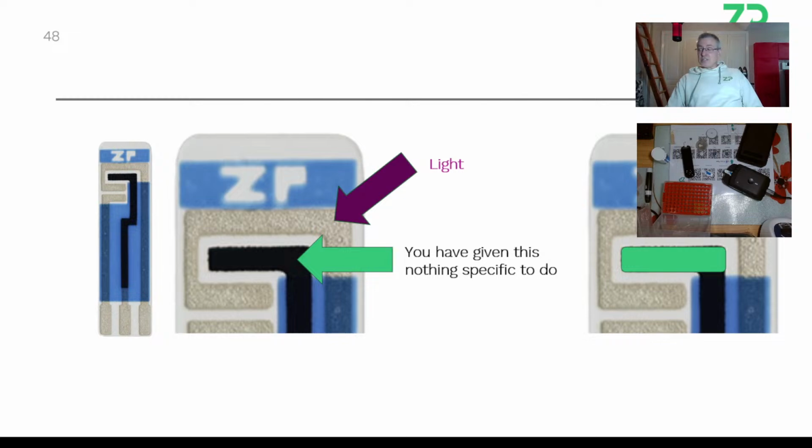What you need to do is actually functionalize that electrode and then do your assessment. Carbon doesn't know what to do. You haven't given it any specificity. Once you put your special materials on there, then you assess it. But understand that the carbon is only there, provided by us in your experiment, to detect essentially your potential. You have to functionalize it. So be careful, because you're myopically going in on the carbon, but that's not the material.